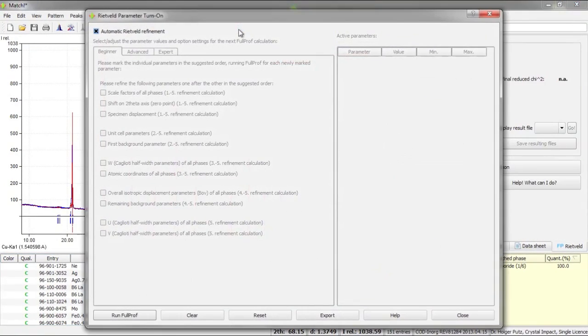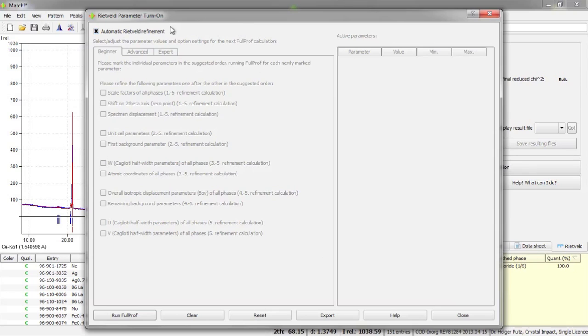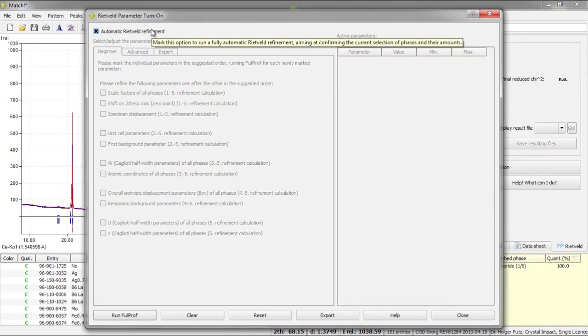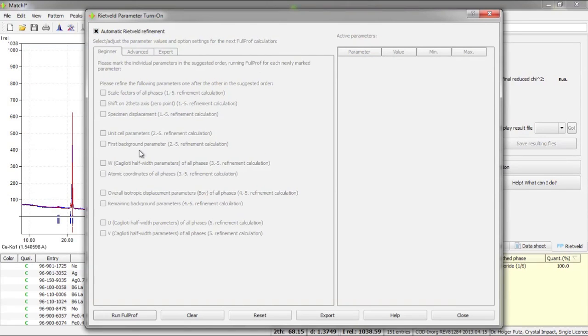Once I've pressed this button the parameter turn-on dialog is displayed and by default the automatic Rietveld refinement is suggested. We will just leave it as it is at the moment and simply run this automatic calculation.